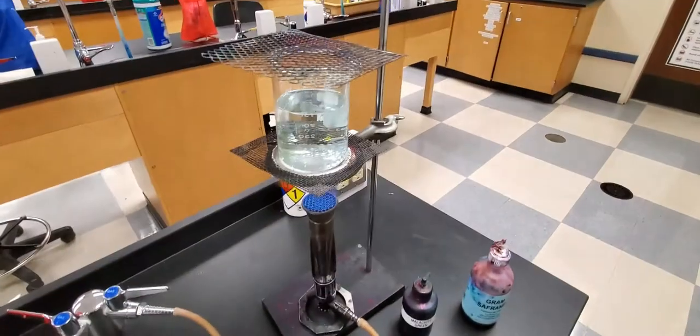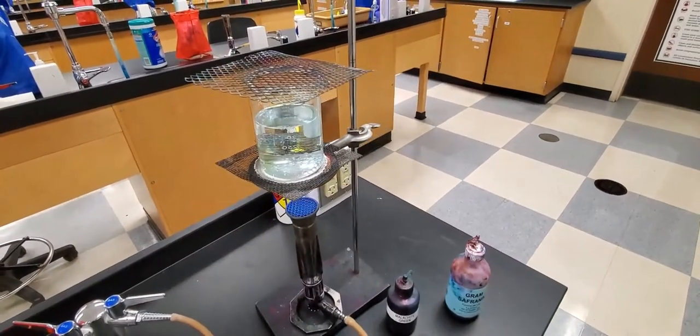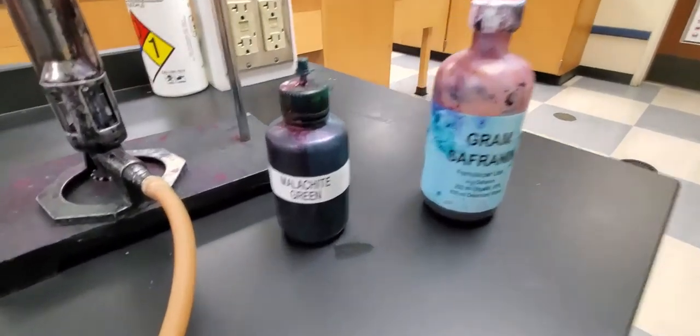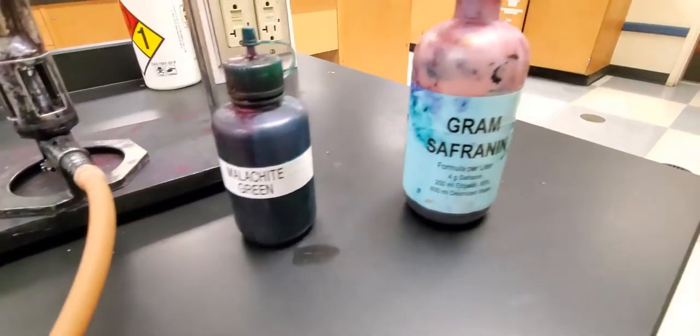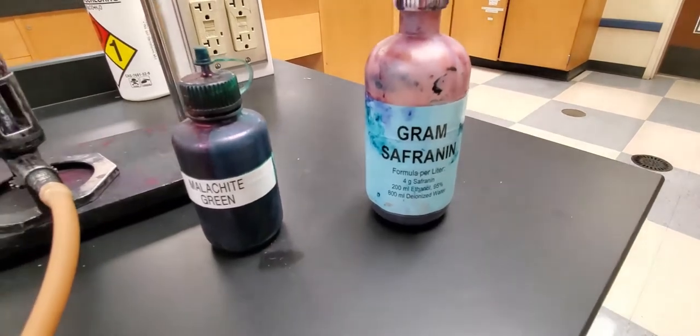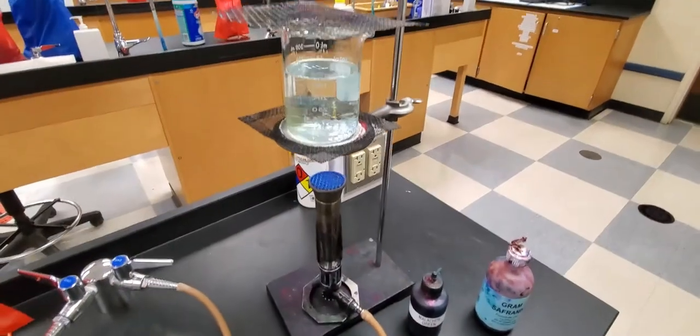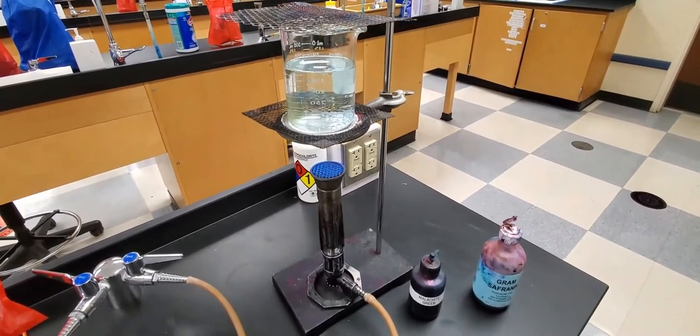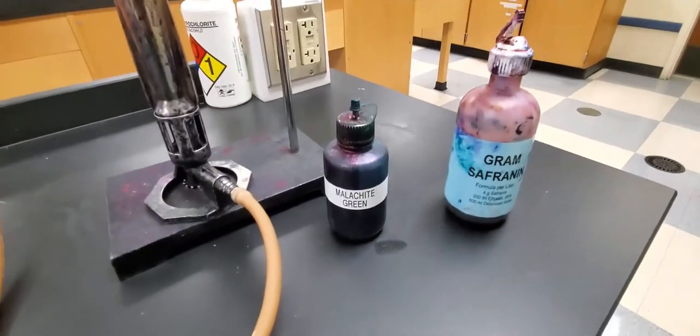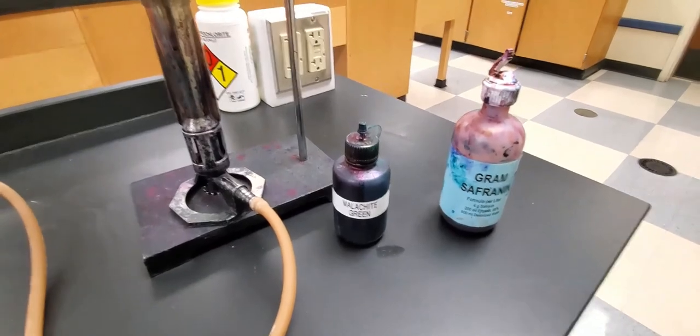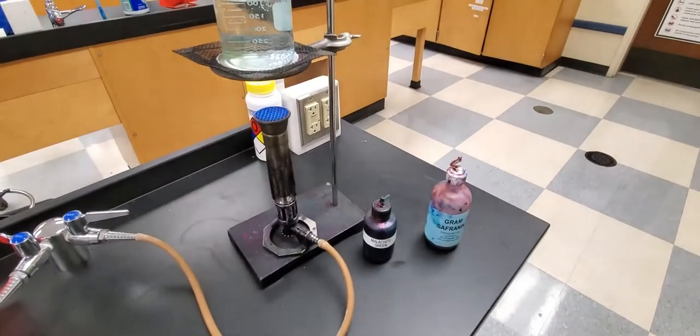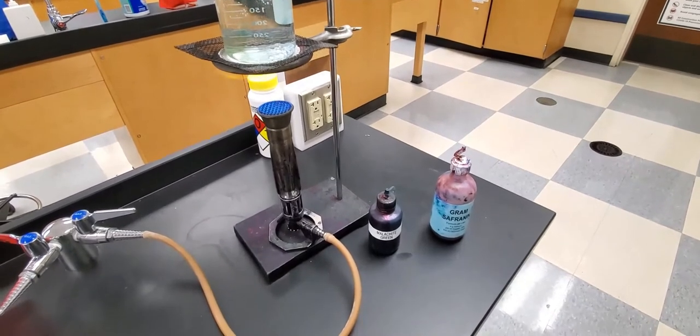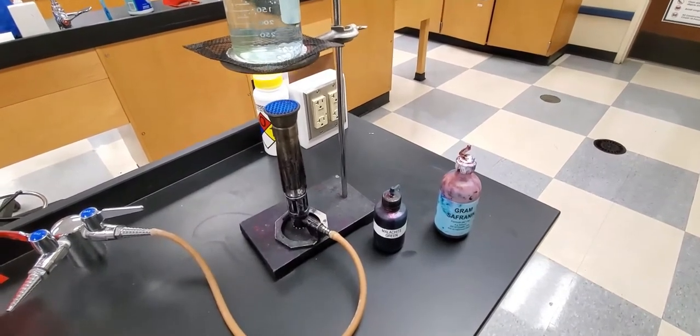Today we're going to be using a boiling water bath along with our malachite green solution and our safranin stain. The point to the water bath is to basically open up the spore coating so that our malachite green dye can get in there. When we go through this process of the endospore stain we're going to decolorize and the malachite green color will come out easily from the body of the cells but it will be trapped in the spore coating.